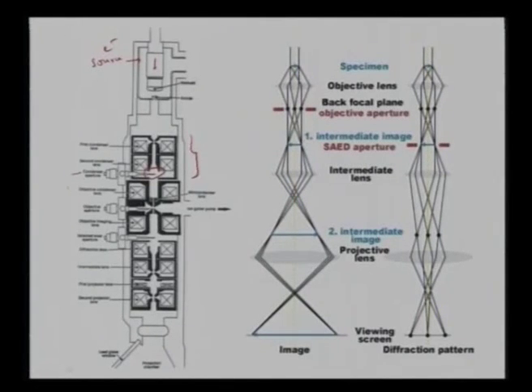And then I have my objective condenser lenses here. Then I have my objective aperture here, and this is what decides the overall resolution of my TEM. Then again I have some objective lenses, then a selected area aperture, and then some diffraction lenses, intermediate lenses, and projector lenses. And I keep my sample in between, which I will come to in the next slide. But this is the overall construct of a TEM: I have my electron source, a set of electromagnetic lenses, first the condenser lenses, then my objective lenses, and then the projector lenses to finally get an image.